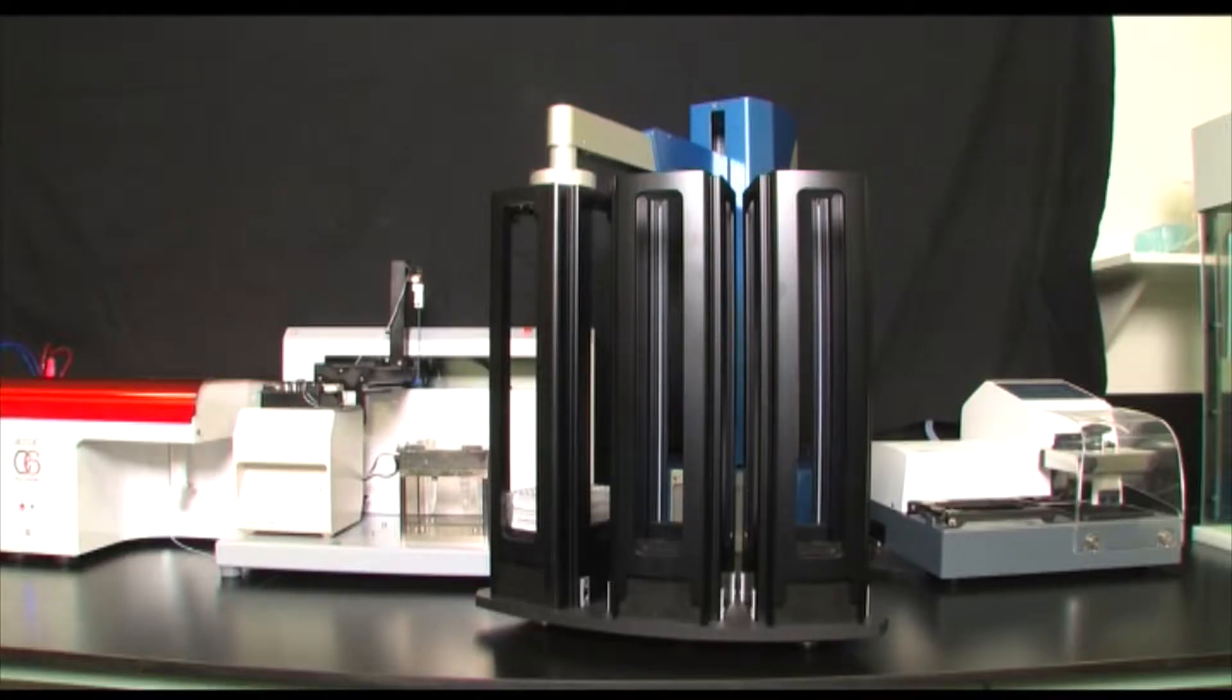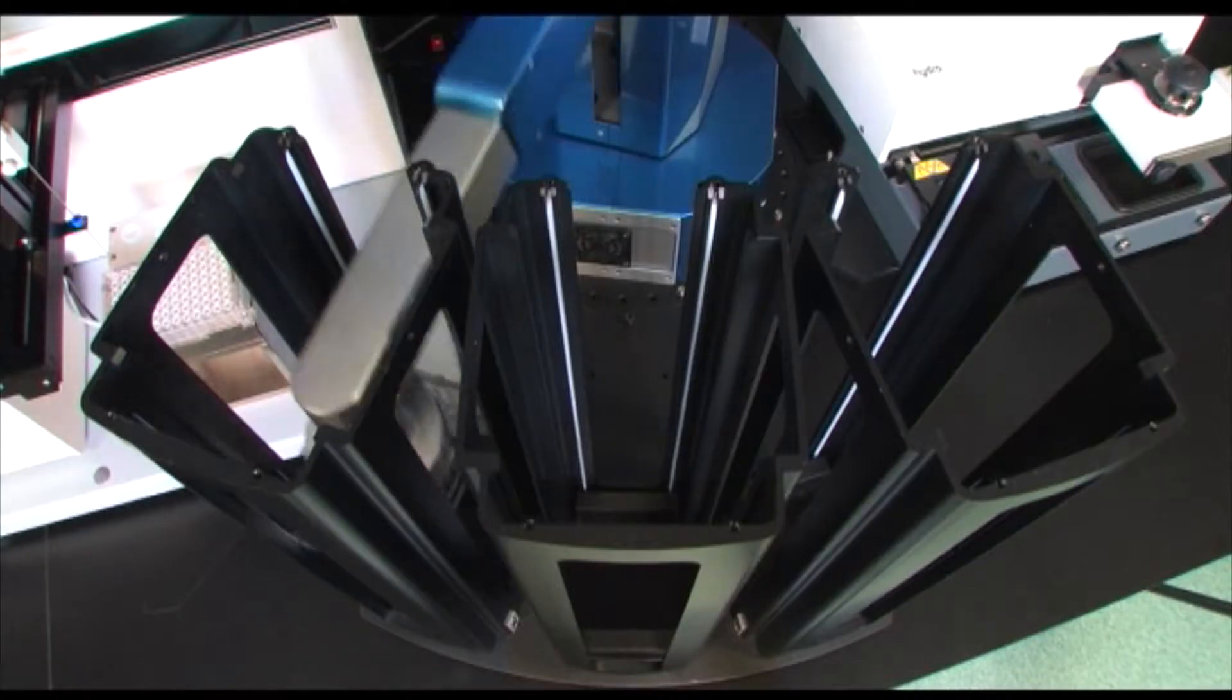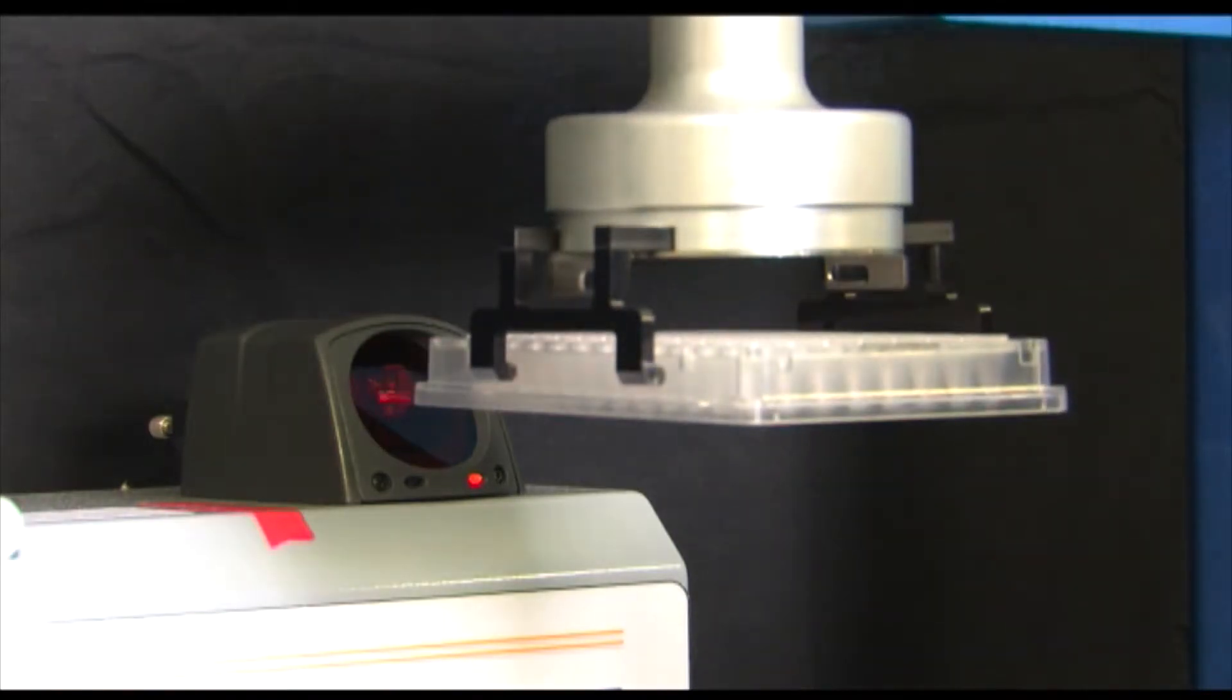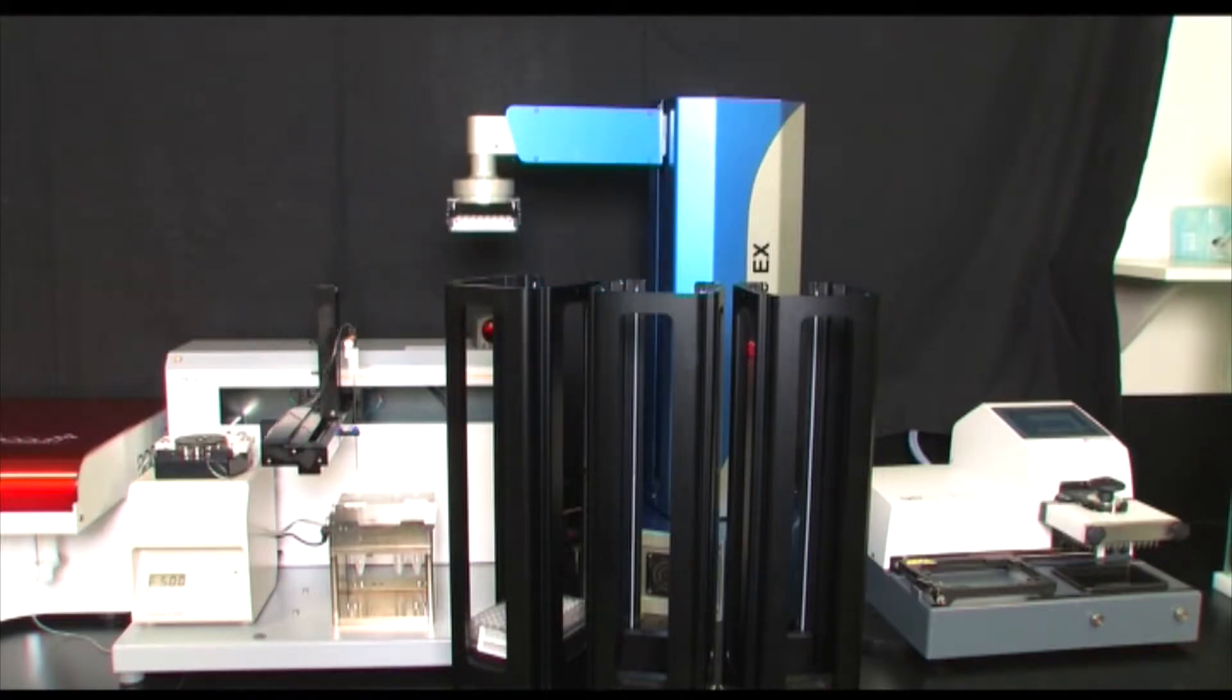The robotic arm of the Sirocco, developed by Hudson Robotics of Springfield, New Jersey, starts by grabbing the first plate from stack one, reading the barcode, and then transporting to the washer.